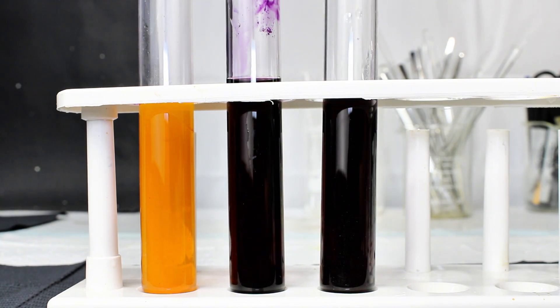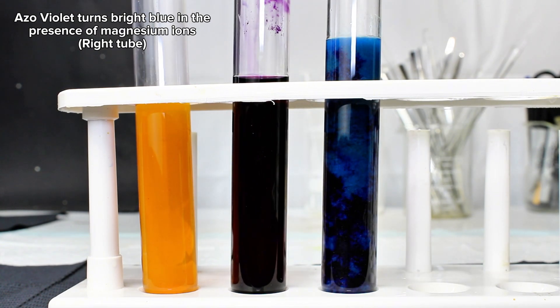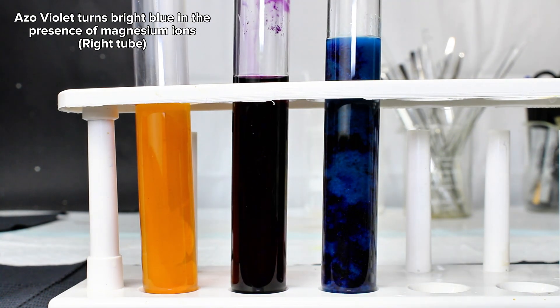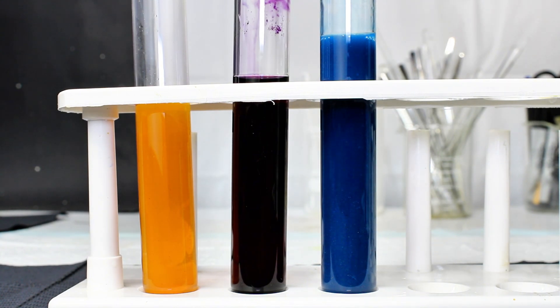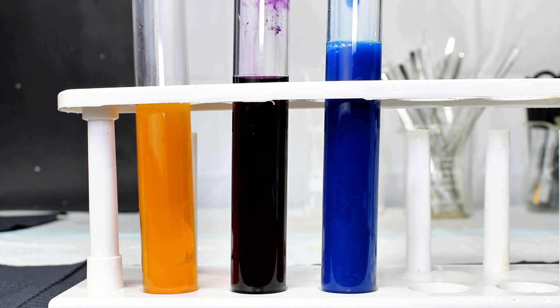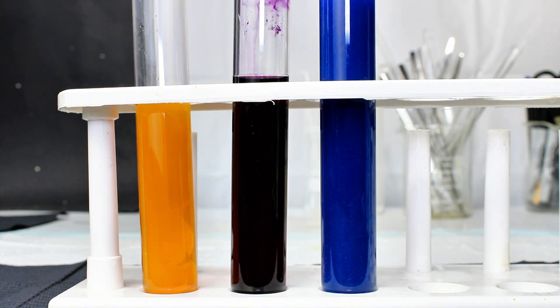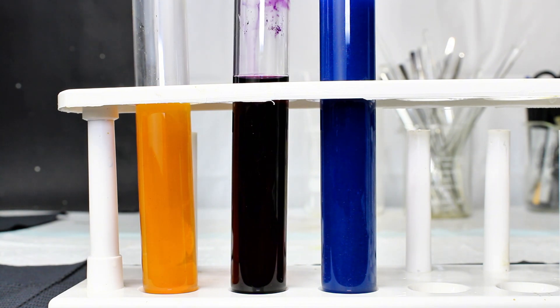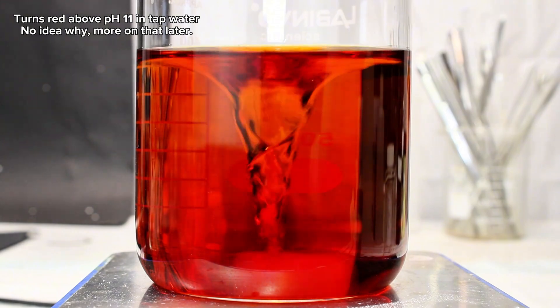Another cool thing about Azo Violet is that it can be used to detect the presence of magnesium ions, and will turn an incredibly deep blue upon reaction with magnesium sulfate in a weakly alkaline solution. I also got a bit of noticeable precipitation a few times I tried this, and I'm really still not sure why, or if this is normal, but it looks pretty cool anyway. I got a good bit of footage messing around with this stuff, which you can hang around to watch if you're interested.